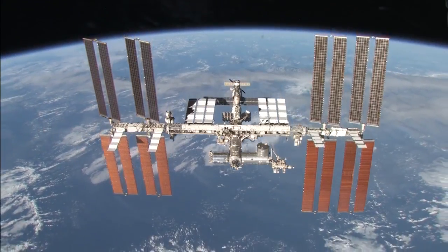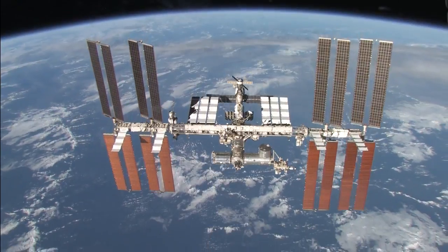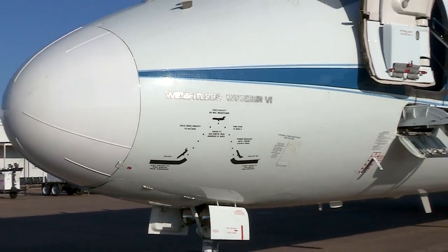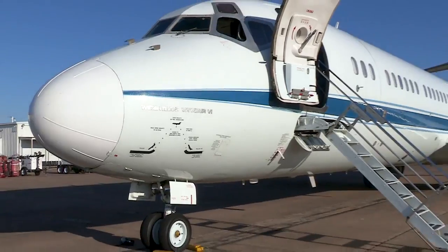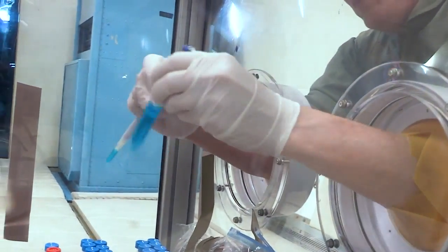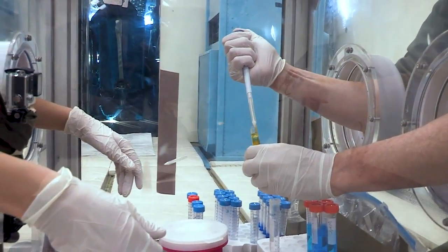The International Space Station is such a resource for us to have, and it really would be great if we could perform the kind of molecular biology experiments that we perform here on Earth on the space station. NASA gave me the opportunity, as well as my postdoc, Lindsay Rosardi, to go on the zero-gravity airplane so we could actually work out those protocols. Basically, you're traveling in an airplane doing these parabolas over and over again.